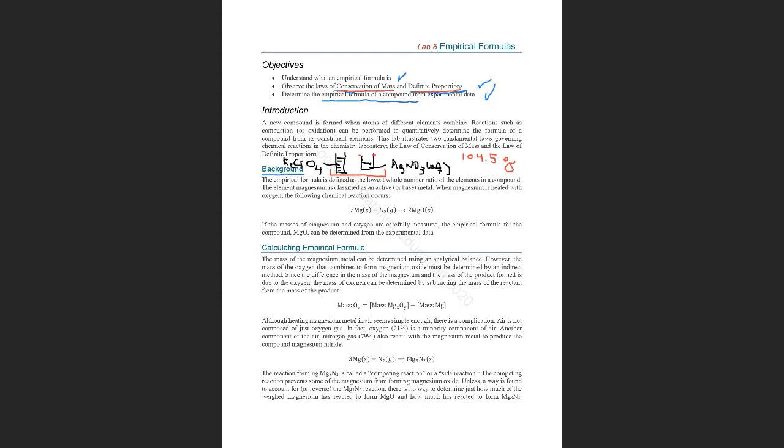So what am I going to do? Well, I will pour the potassium chromate into the beaker and mix it. I had two liquids, and now in the beaker, I see that I have a solid.